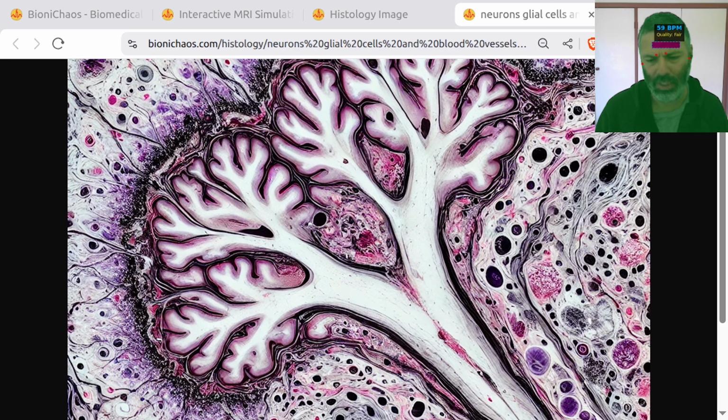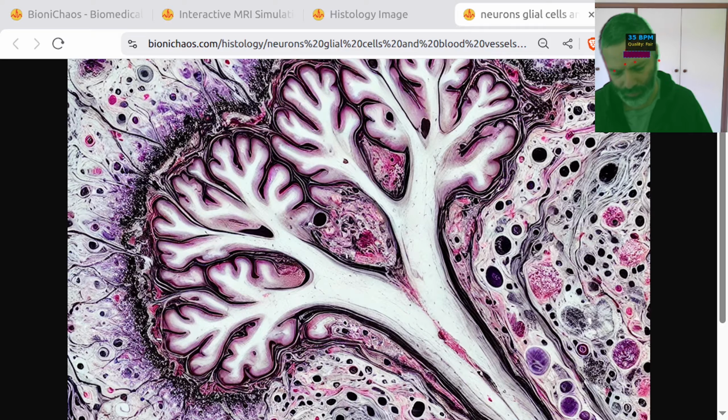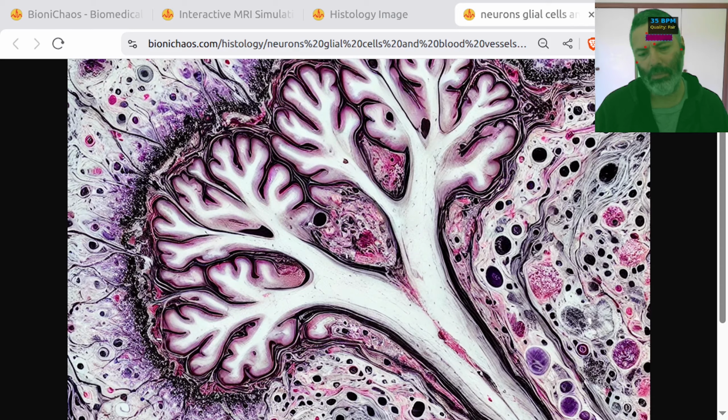So forget the downloading. The download is the low priority at the moment. We want to generate or load an image or have preset images. Then we want to do image segmentation and stuff like that on it. Count cells, for example, or have a list of other processes we could do. So, for example, counting cells, or what else?